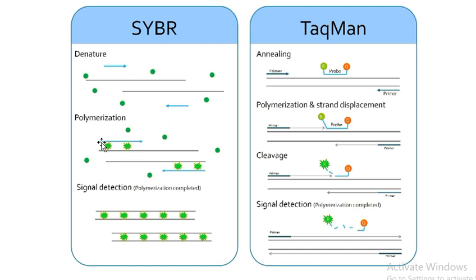So when the extension happens, let's say during the extension, complementary DNA is readily added to the other strand, the template strand, right? The nucleotides are complementarily added. So here during the extension, each hydrogen bond will be bound with this fluorochrome till the end of the reaction, because extension is nothing but the hydrogen bonding happening till the end of the reaction. So throughout that hydrogen bonding addition, we will have this fluorochrome giving the color. So during the process we can see this color formation.